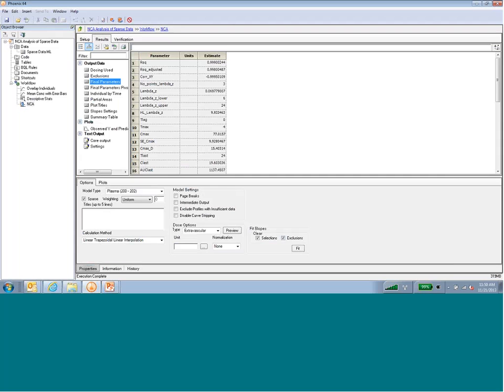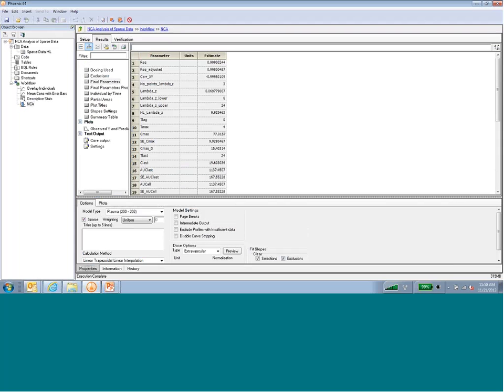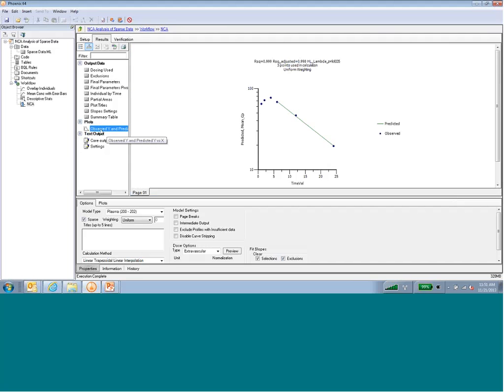So in the Sparse NCA, we have the standard non-compartmental analysis parameters, with the addition of a standard error for the Cmax, which is this SE_Cmax, so you can compare the standard error to the mean, as well as the standard error for the AUClast. And then on the output plot, this is the mean plasma concentrations for the pooled subjects.